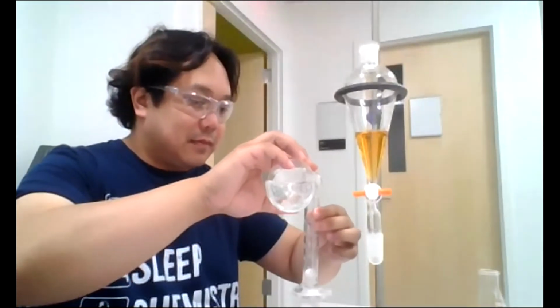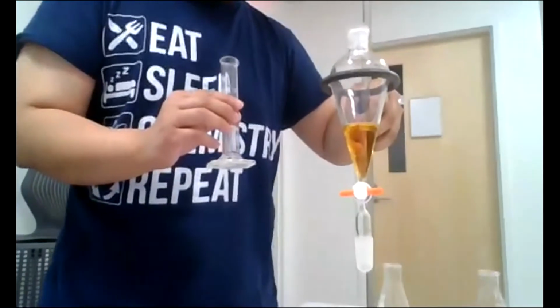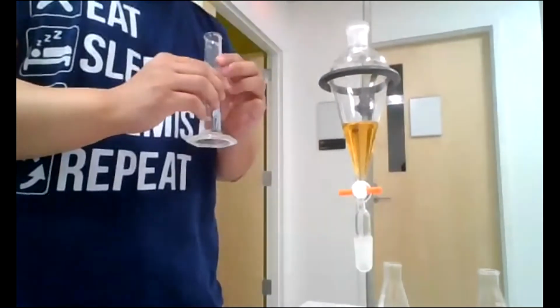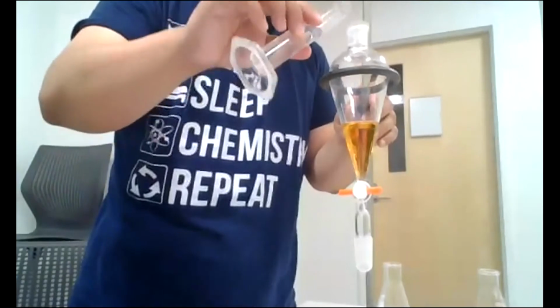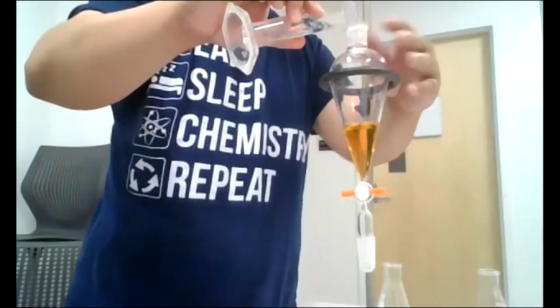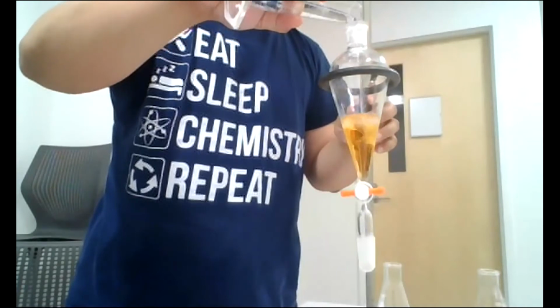Keep an eye on what's happening with the separatory funnel. This is, again, practicing good observational skills. As your partner pours, can you describe what's happening in the separatory funnel? So pour all of it.